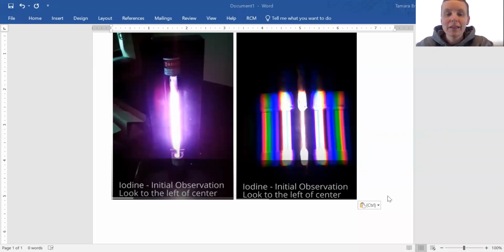All right, so this is the gas emission kind of instructional video. If you weren't in class to do the gas emission lab, this is kind of how you're going to do it on your own. You're going to be watching a YouTube video, and so I have two clips from that YouTube video right here below.